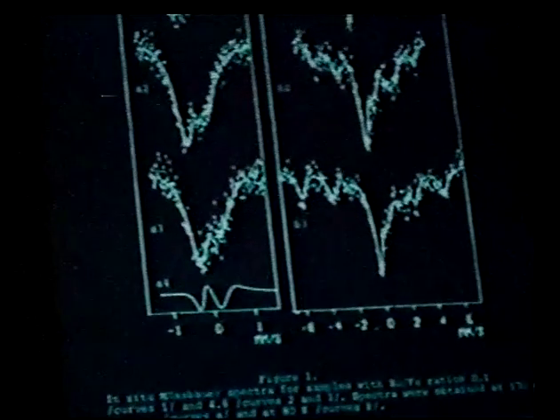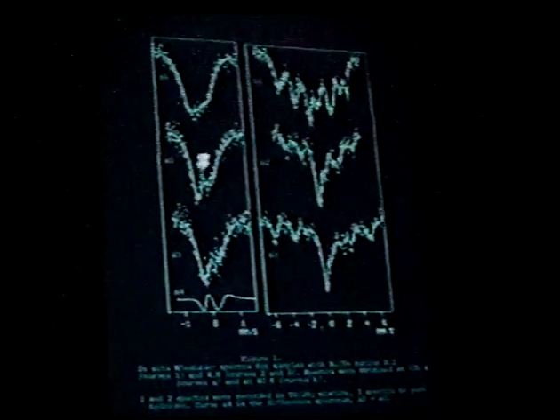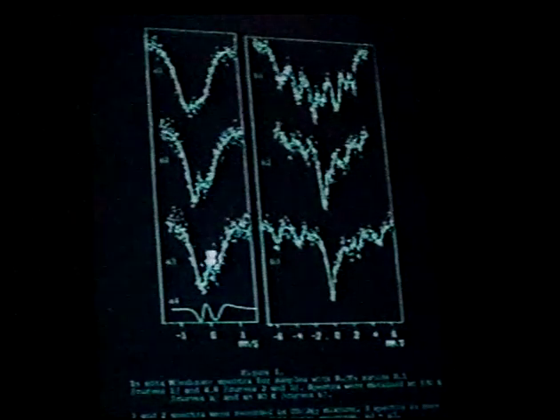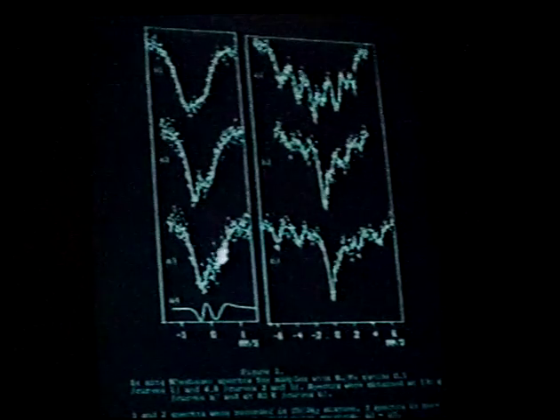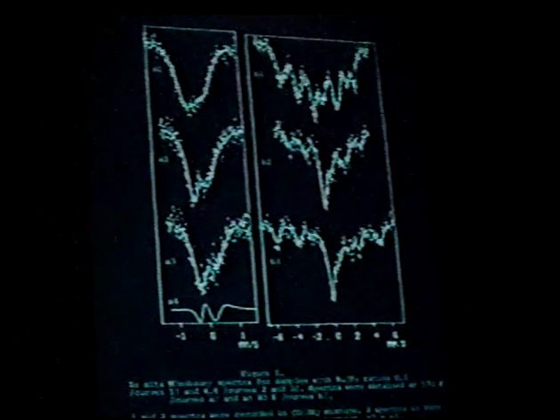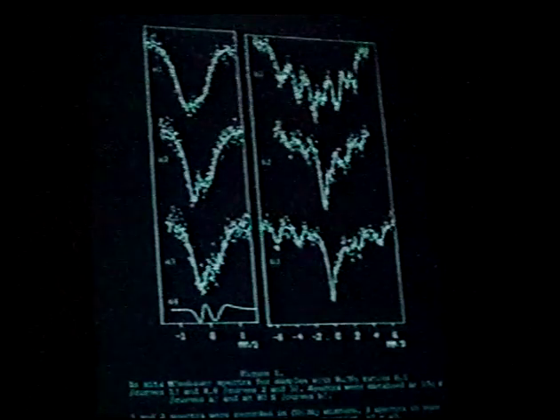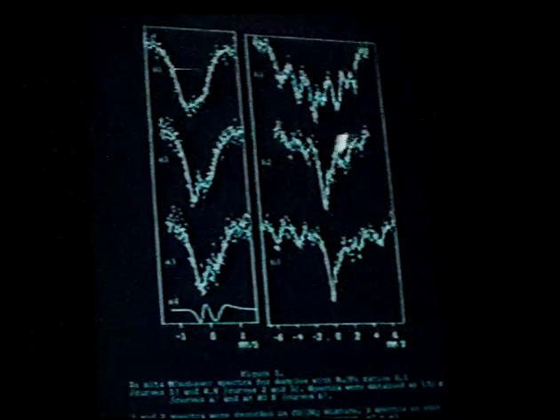Now it shows a similar experiment, so we had to be very careful. This indicates, at 300 degrees C, no, sorry, this is 500, 300 degrees C, yes, the spectrum. And this is after switching off the CO from the gas stream. I must admit that the statistics is very poor here, but after subtracting this one from this one, you can have this particle droplet here in a very small intensity. The very small intensity means that the surface contains only a very small fraction of this reactive carbon, and a quite large fraction still contains some carbide, which can be identified by these spectra here.